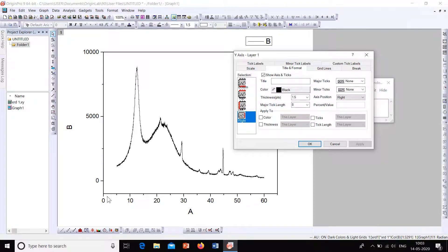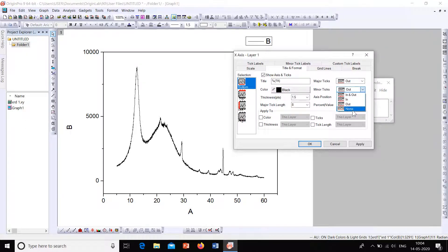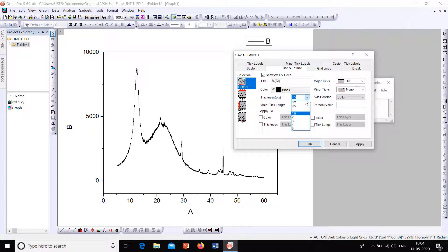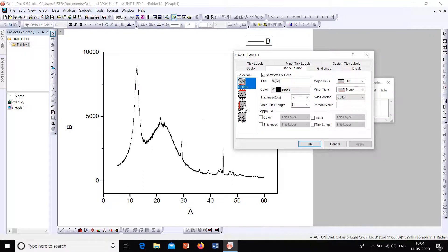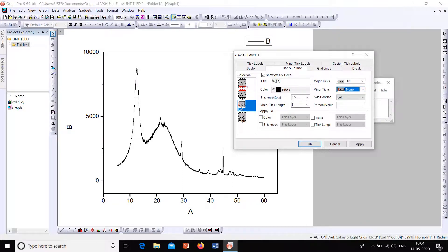At the bottom we have minor ticks which don't look good, so go to Bottom and set Minor Ticks to None. Now we can increase the thickness of the axis line — go to the thickness option and select a higher value, then apply. That looks nice. Go to Left as well, set Minor Ticks to None and increase the thickness.